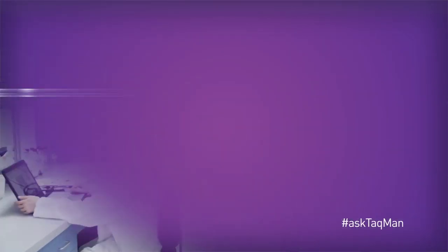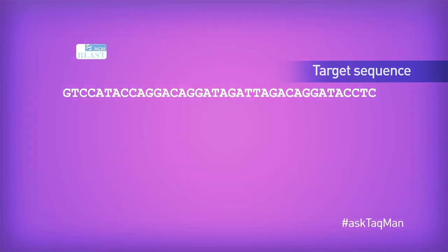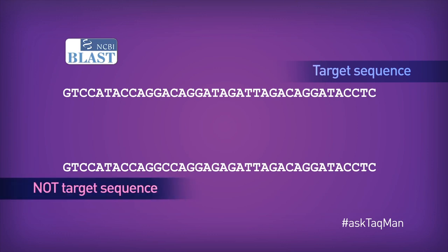Say I have a target sequence to which I want to design a probe. Now before I do that, I take the scientifically responsible step of blasting the sequence against all known transcribed sequences for the same organism. The point is to find out if my sequence is unique or not. Unfortunately, what I find is that there is a very similar sequence, perhaps a gene family member, with only two bases differentiating these two sequences.